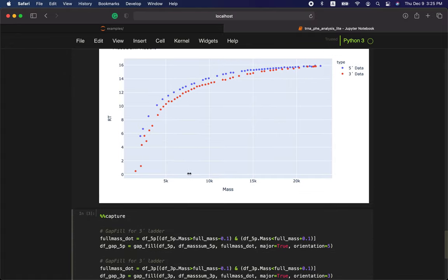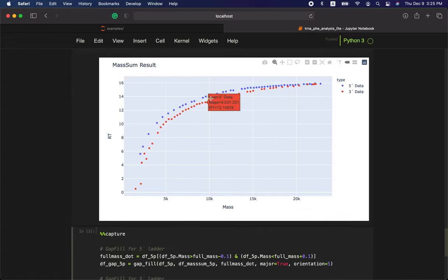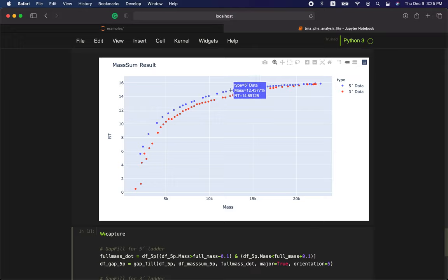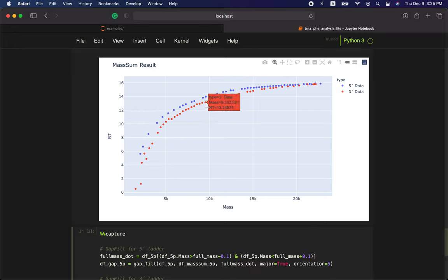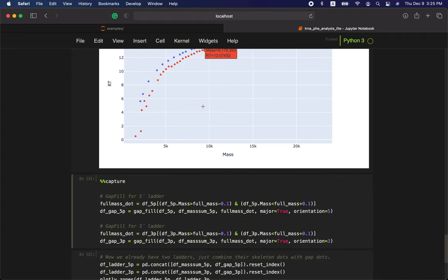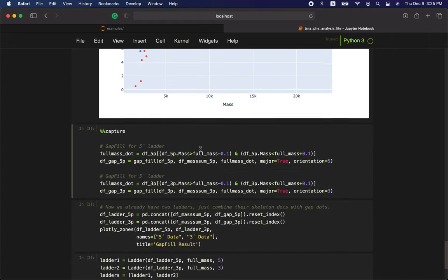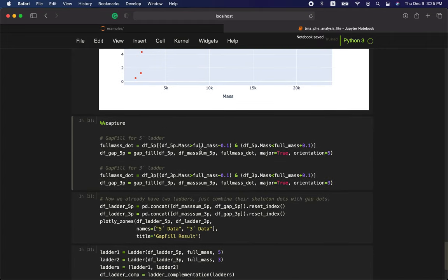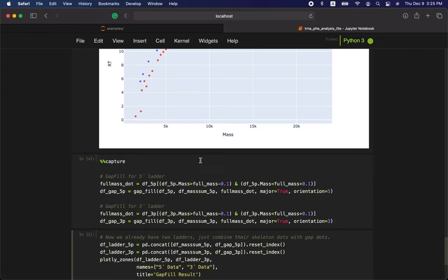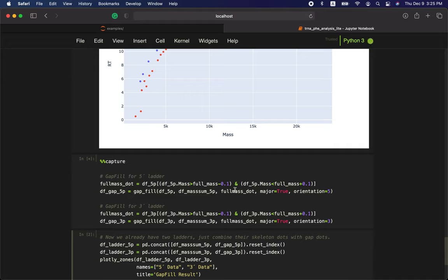You may notice that there exist several gaps. Next, we try to fill those gaps by doing gap fill. This cell will take a bit of time to run.